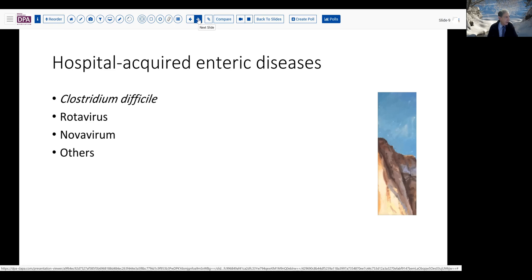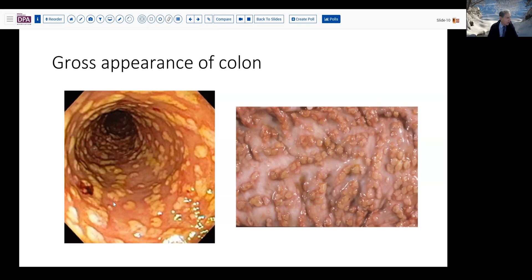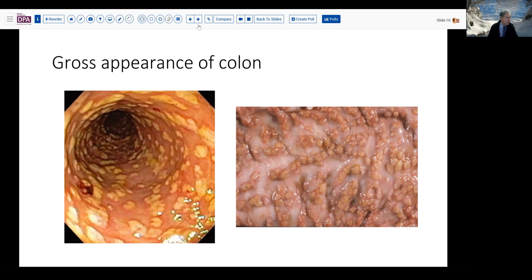So let's go right to the histologic slides. Here is the gross appearance of what might be encountered in this kind of situation — you see the lumen of the colon studded with these slightly raised pale yellow plaques, which sometimes have a little bit more tan appearance. In this resected specimen you might wonder, is this just ulcerative colitis? But in fact it is not — it's these little punctate exudative areas which provide the clue to what's going on.